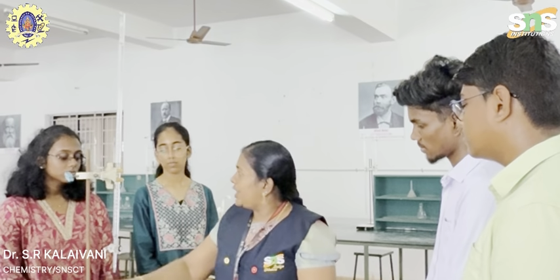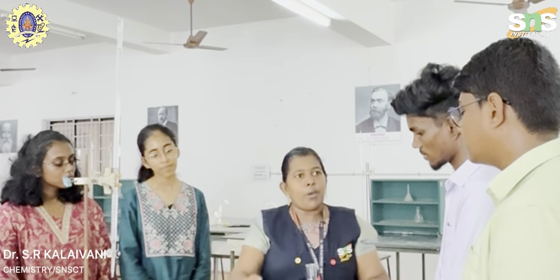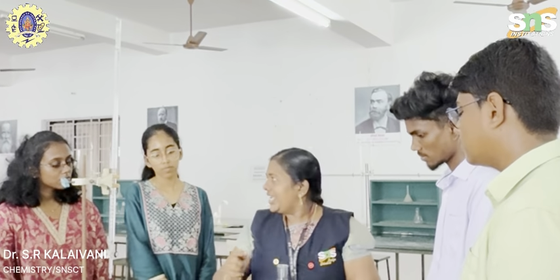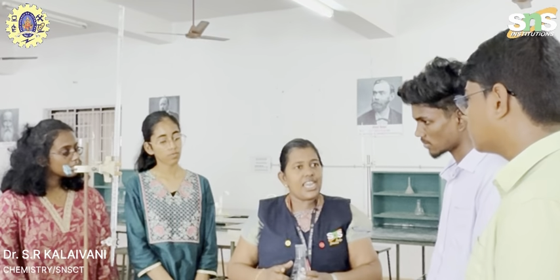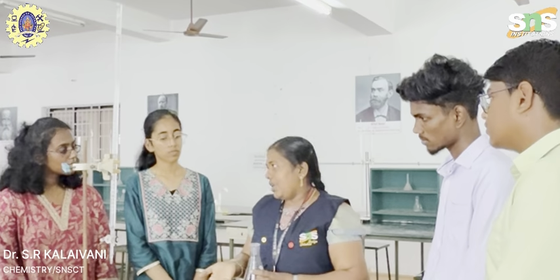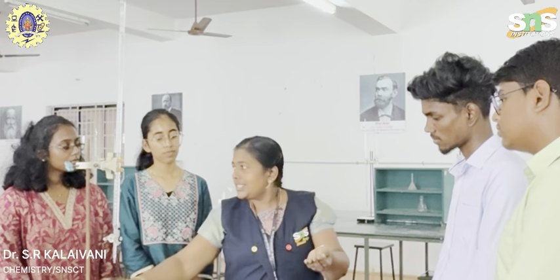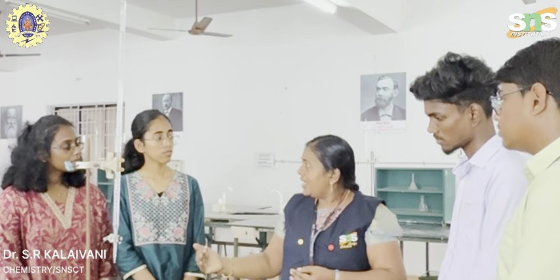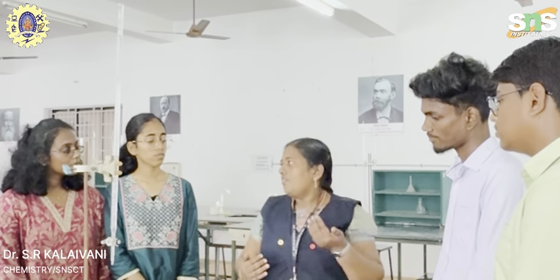Same method, 20 ml of the boiled water is pipetted out. Then again add the same ammonia buffer and the same indicator. Wine red color is formed. That wine red color is titrated against EDTA. It turns to steel blue. So from this experiment, we can find out the amount of total hardness, the amount of permanent hardness, and the amount of temporary hardness present in our water sample.